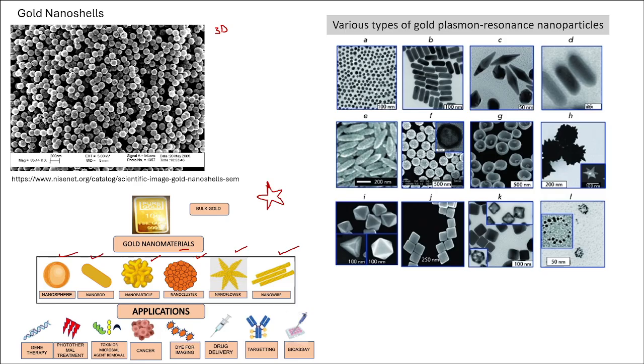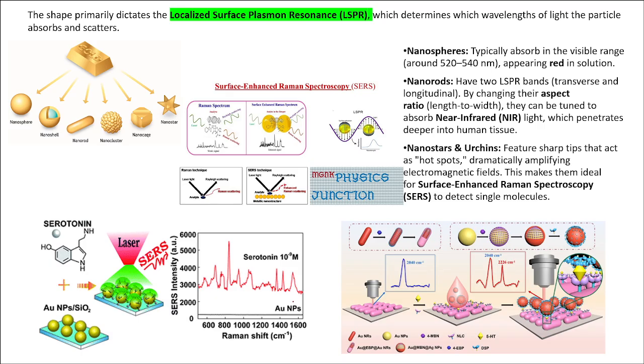So these pointed surfaces, these shapes basically act as hotspots for the electromagnetic radiation that is falling on it, and I'll show why this is important. At this point, you can see these images, these rods and all those things. So there's a kind of 3D structure that we can see with scanning electron microscopy.